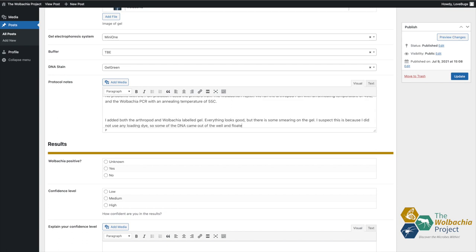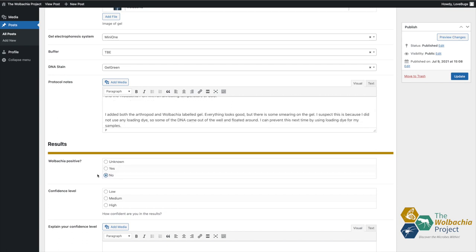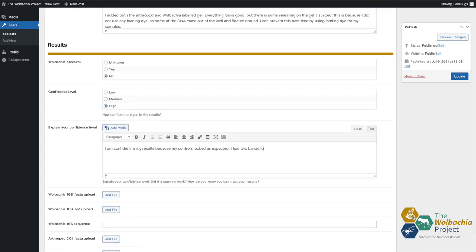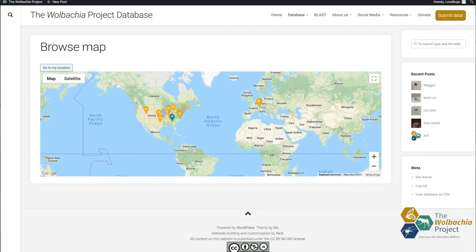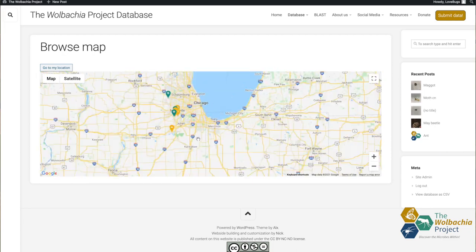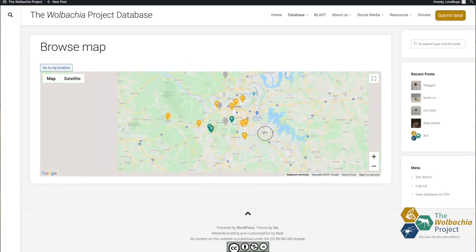Once I interpret my labeled gel, I'm able to determine if my arthropod had Wolbachia or not. Once I save this database post, other researchers and students across the globe will be able to refer to my data and my results.